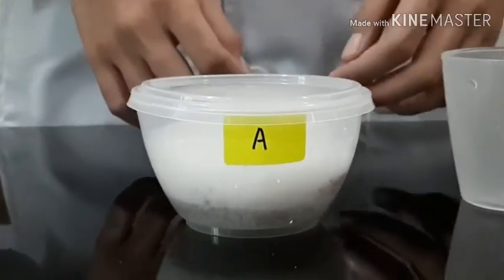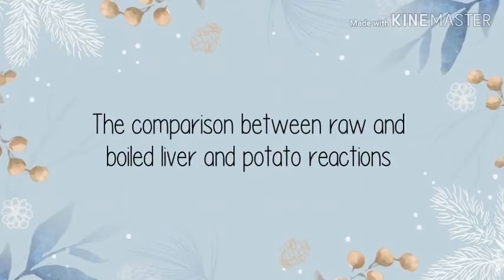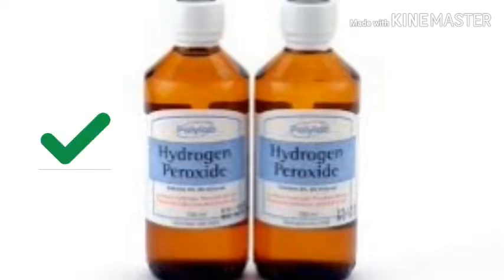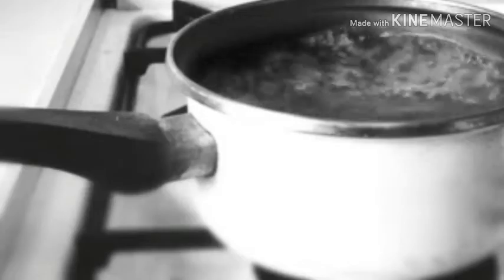Hydrogen peroxide reacts to the raw chicken liver and raw potato by producing oxygen and bubbles. Raw chicken liver and raw potato have the catalase enzyme so they react to the hydrogen peroxide. But boiled chicken liver and boiled potato do not react to the hydrogen peroxide. The chemical reaction, which is the bubbling, will not take place because boiling destroys the enzymes.